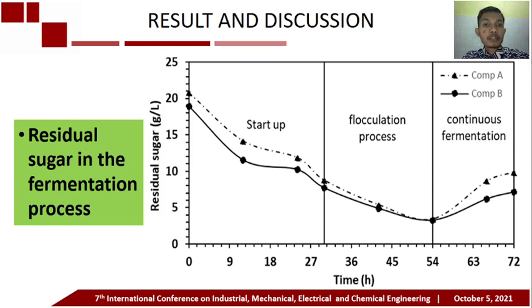The feeding medium is started at 54 hours after inoculation, where the residual sugar starts to increase as well as Saccharomyces cerevisiae also increases in the related time. This phenomenon explains that sucrose feeding rate is higher than the consumption.